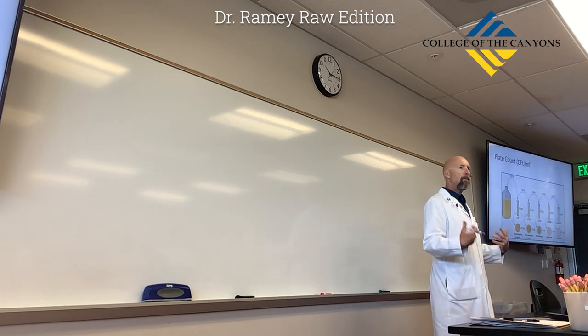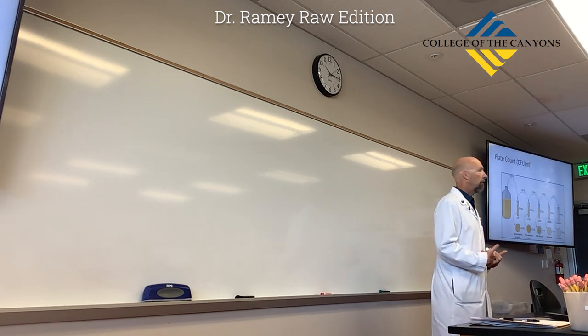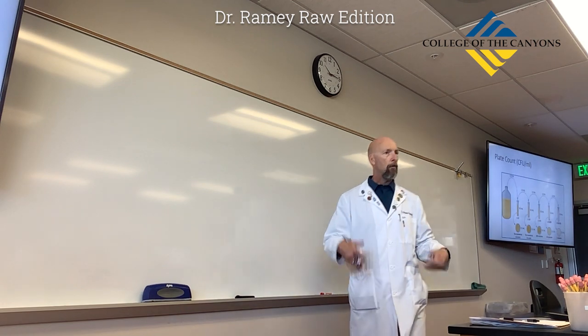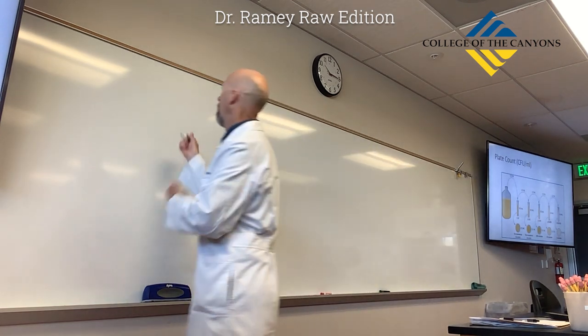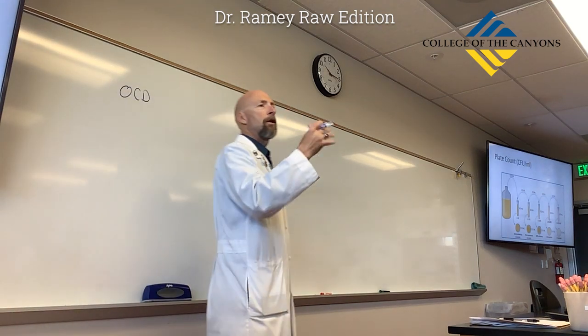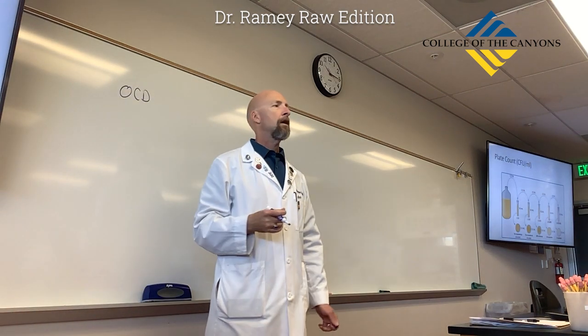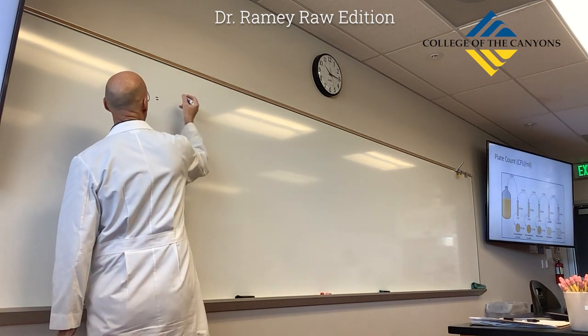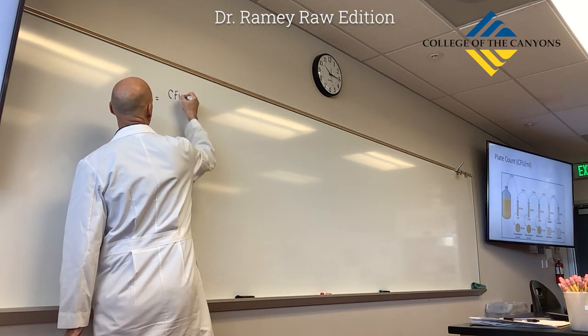I mean, I might be a little OCD or a lot OCD maybe, but in this context, what does OCD mean or stand for? Original culture density. Or you could even say original cell density. It really, in this case, means the same thing, OCD. And we calculate OCD in CFUs per mil.